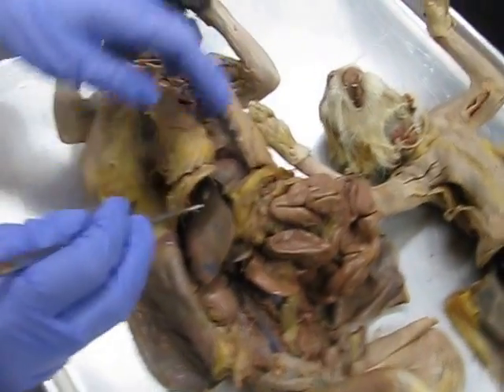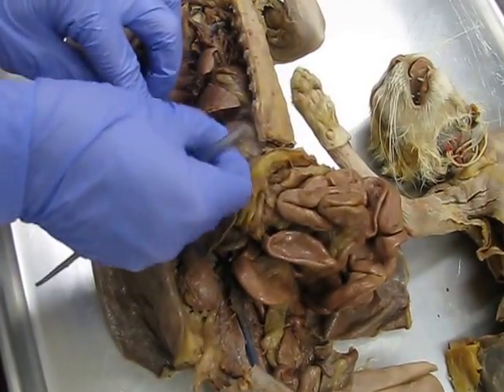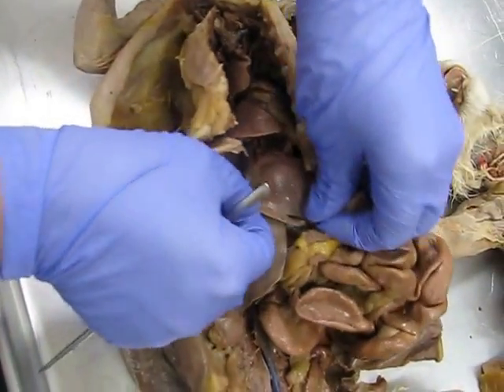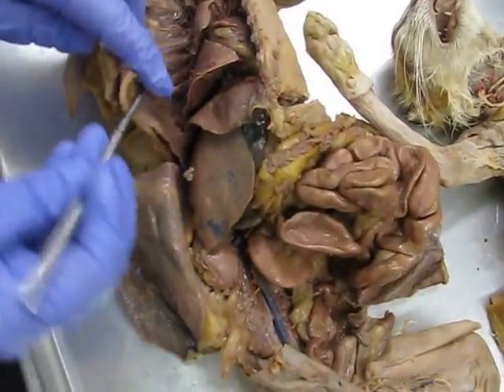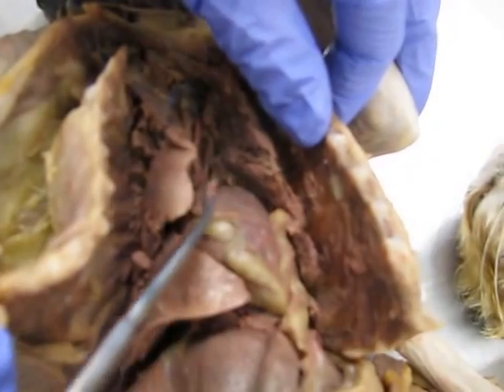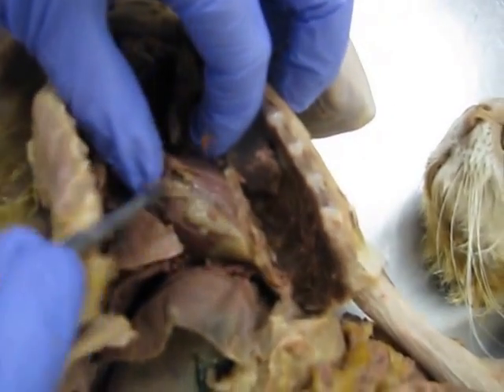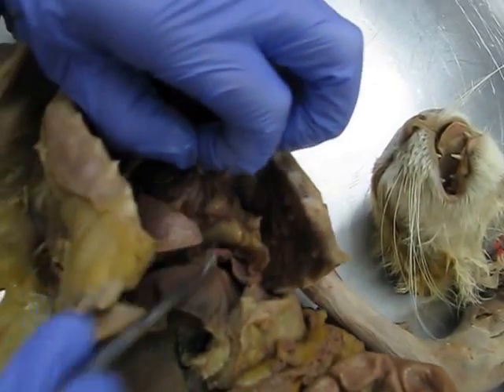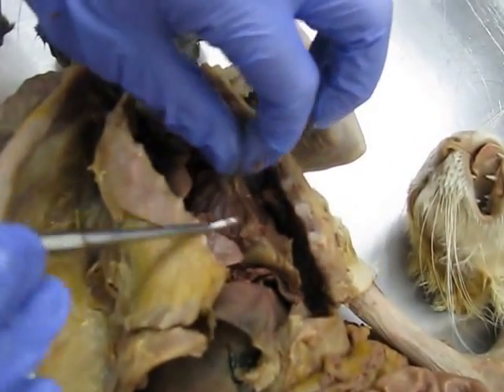Alright, so if we take a look at the cat, if we locate the liver, then just superior to the liver we can find the diaphragm. So you'll be able to see that muscular diaphragm. That's again going to be superior to the liver. We can also see in the thoracic cavity the lungs, which are going to be on either side of the heart. And the heart is going to be housed in a pericardial sac. So surrounding this heart, take away some of that fat tissue, you can kind of pull up and see that pericardial sac that's going to be surrounding the heart.